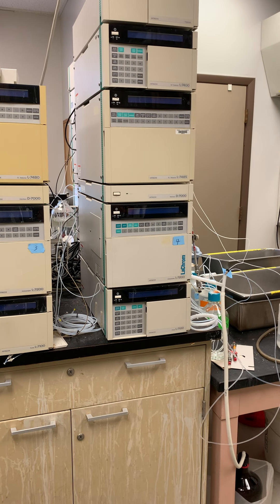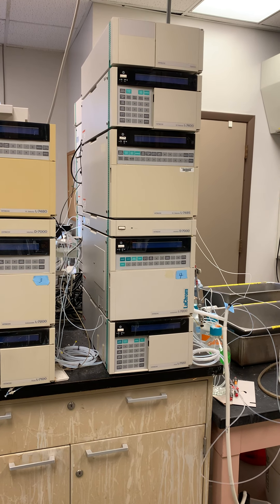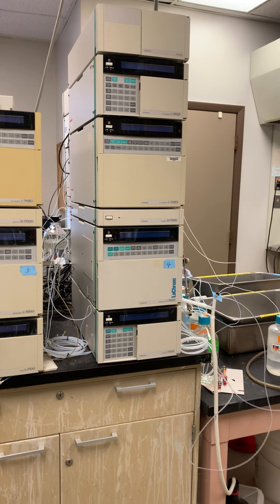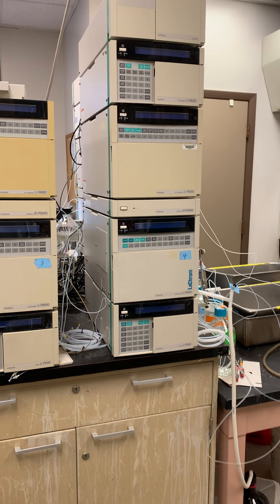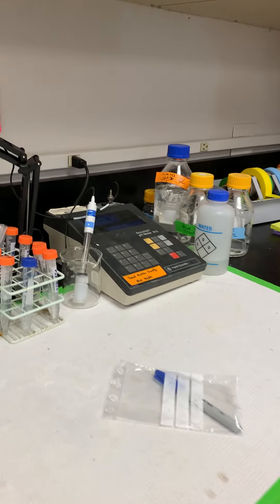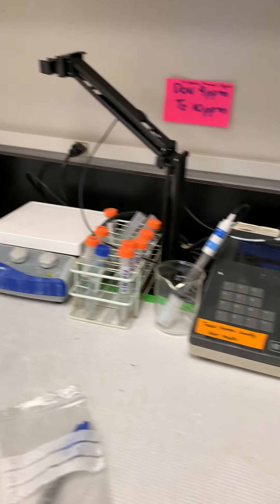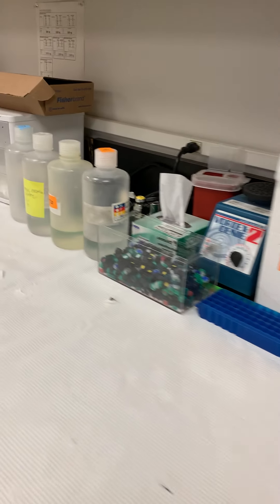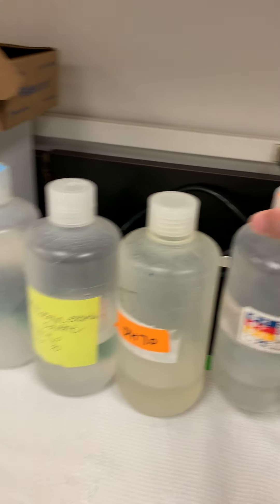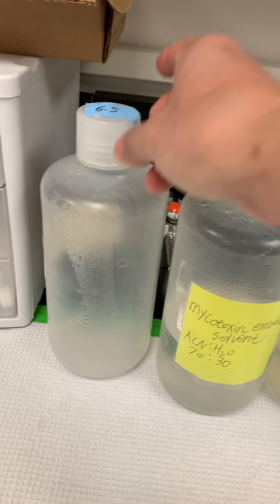I have four HPLCs for mycotoxin binder evaluation. Most of the binders are clays. We evaluate them for mycotoxin adsorption in an in vitro study. We study the clays in two buffers — one at pH 3 and one at pH 6.5 — and sometimes also at pH 7.